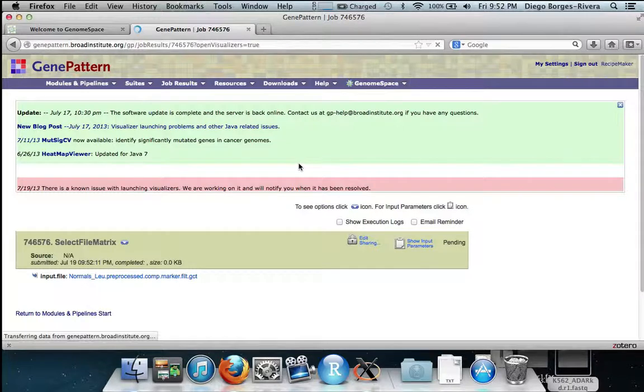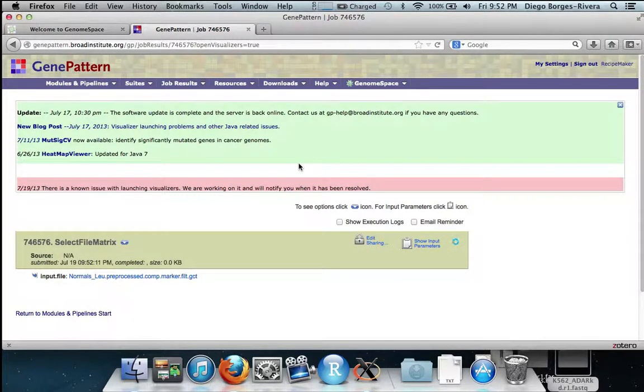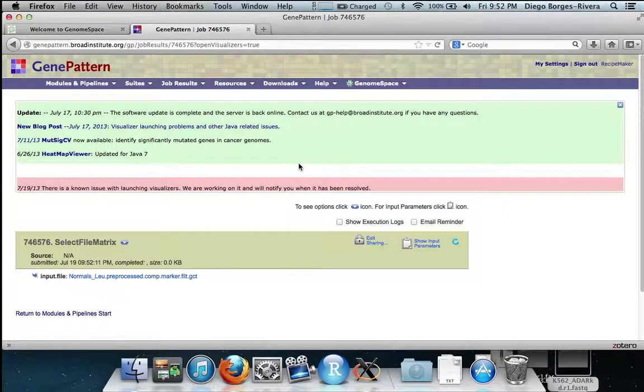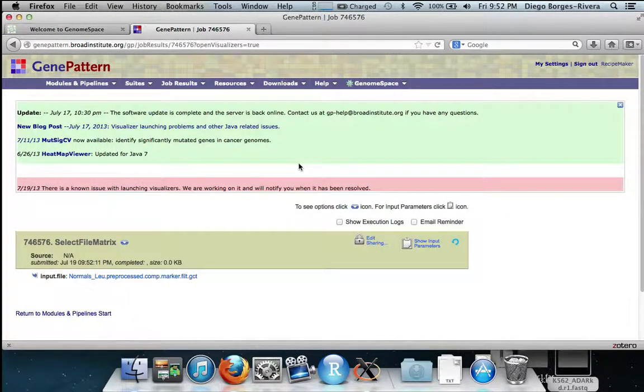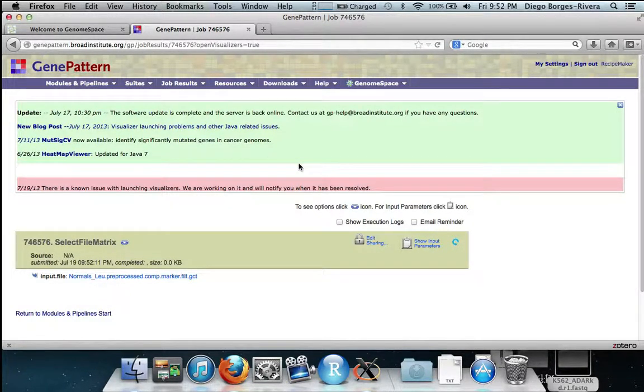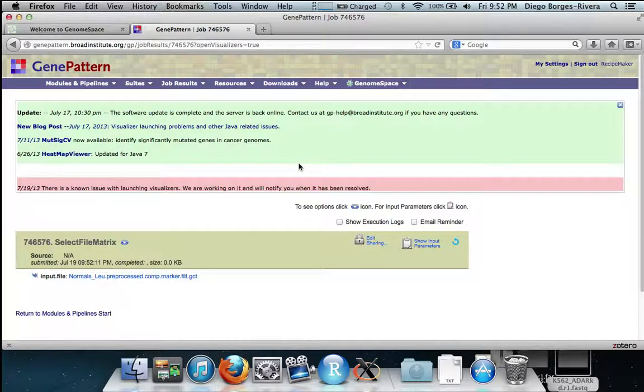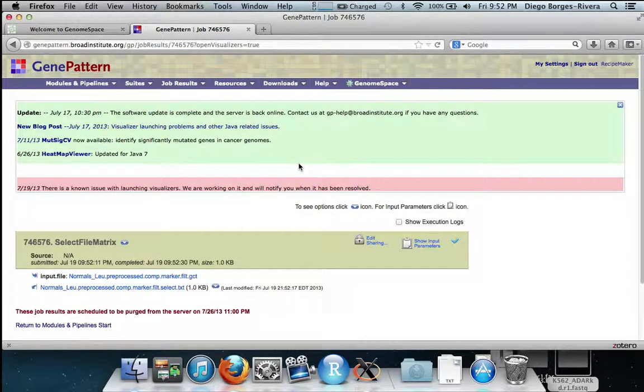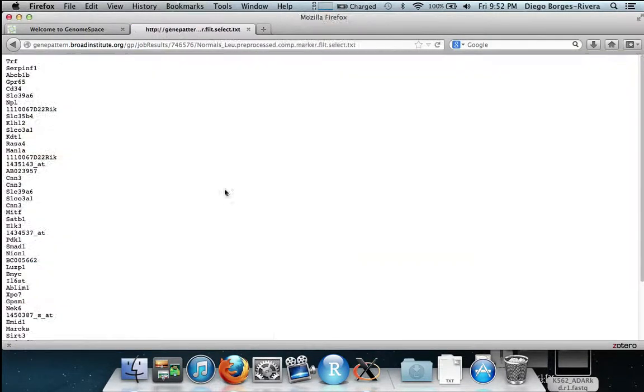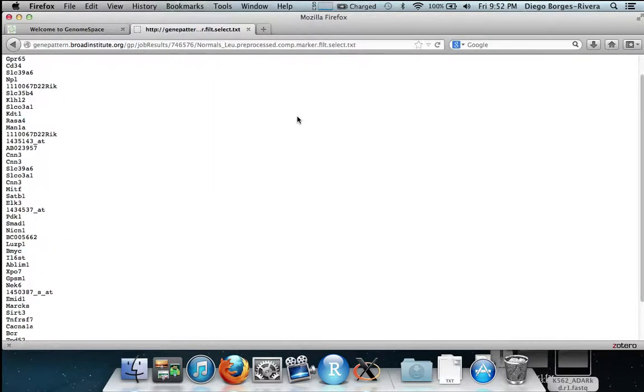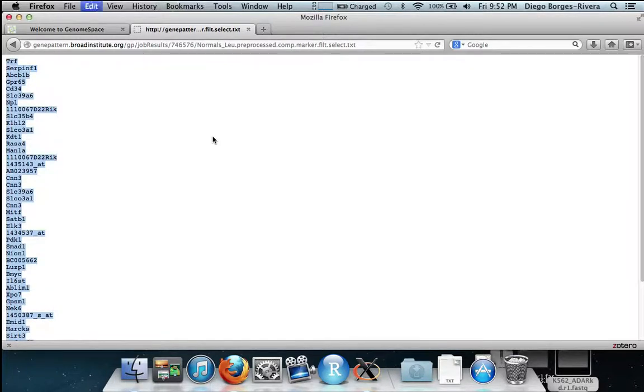This module will simply go through the GCT file and select the second column which contains the gene names of the differentially expressed genes. The gene names will be output in a simple text file which we will then click and open within our browser to save the gene names of the expressed genes. We highlight all of them and then copy them for use in Cytoscape soon.